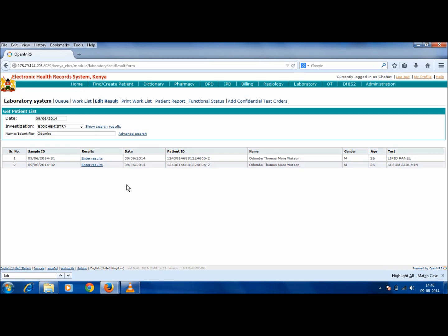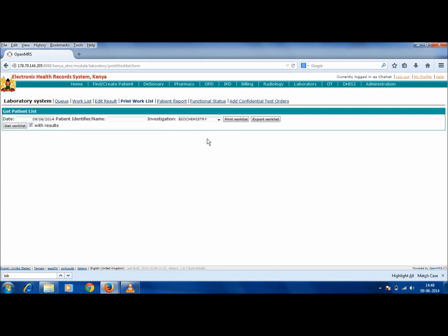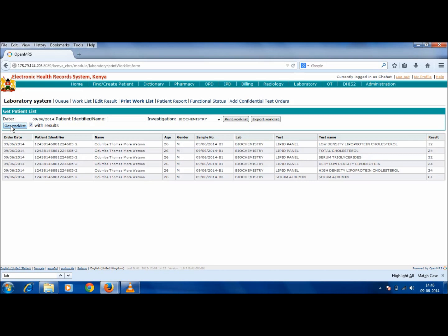Once the Work List has been filled correctly and edited if needed, we move to the next tab which is Print Work List. Click on Print Work List. Select a date and select the investigation from the drop-down menu. One sub-lab could be chosen or a consolidated list could also be chosen from this drop-down. Then click on Get Work List. Now this is the Work List of all the results that have been entered in the department of Biochemistry. There is also an option to generate this Work List without results by unchecking this box and then clicking on Get Work List, or with results by checking the box.